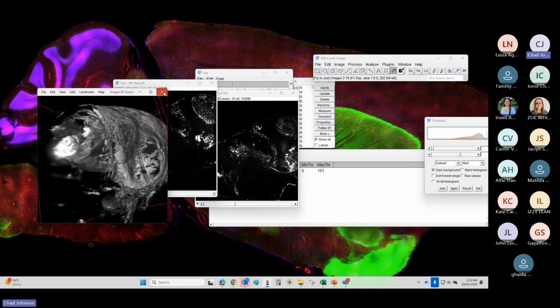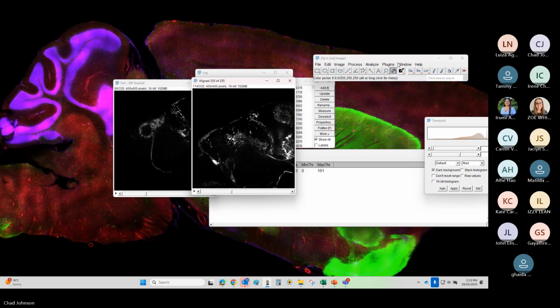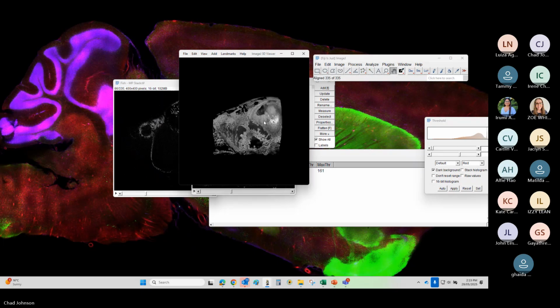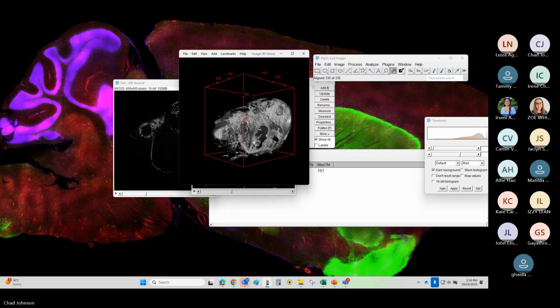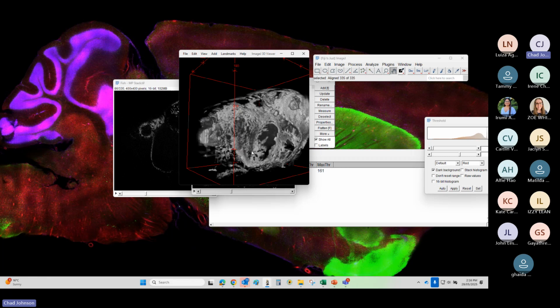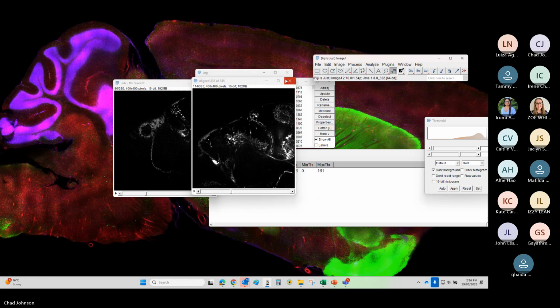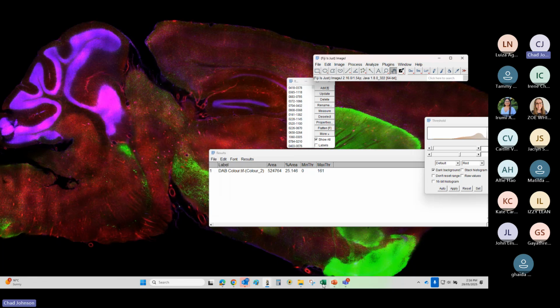Now in the other image, we shouldn't have that anymore. So that's all now been aligned and it's all nice and smooth. So that's an optical image.